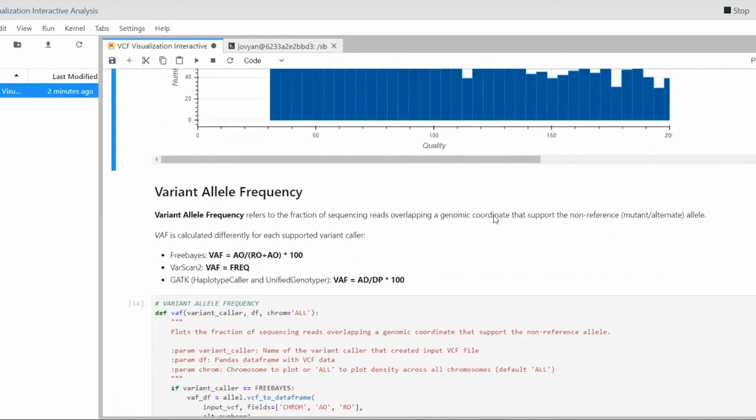So the idea is, you would have your genotypes, 1000 genomes or TOPMed data. You would look at the quality, determine if you need to filter any more, and then you would basically have everything you need to start to do your GWAS test.